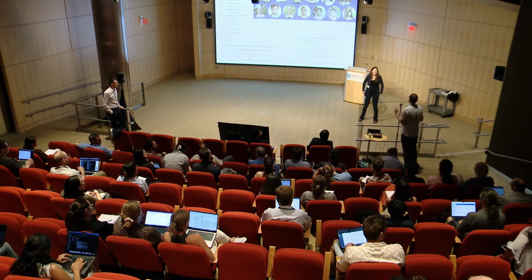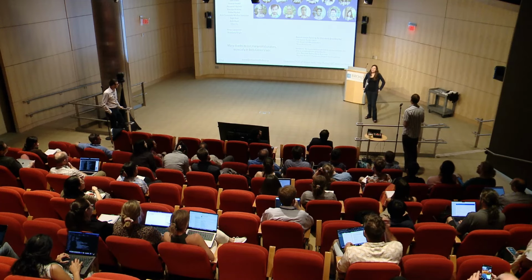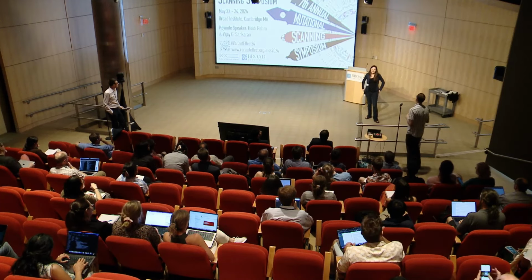Have some success stories that you could highlight? So we don't have a single attempt to do this with variants specifically. So far the only case where we've done it is overexpressing a gene, which in this case is maybe producing a dominant negative, so essentially a loss of function phenotype. So the only cases we've done it is using overexpression. So we haven't tried it. In theory, it seems like we should be able to make it work, so we don't have a sense of the percentages.